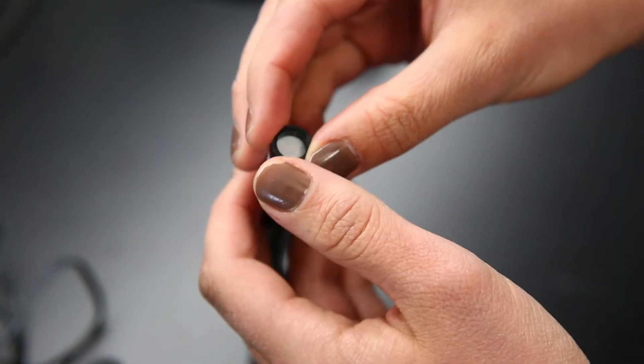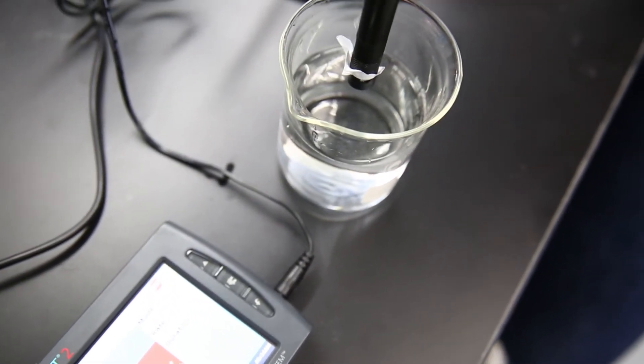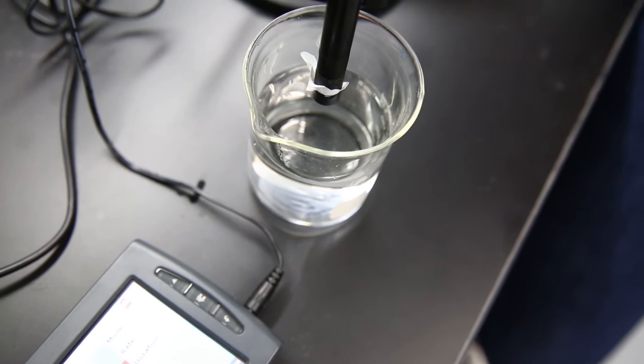For starters, try to calibrate the probes following the manufacturer's instructions. Plug it in and let it warm up over a sample of water for at least five minutes.